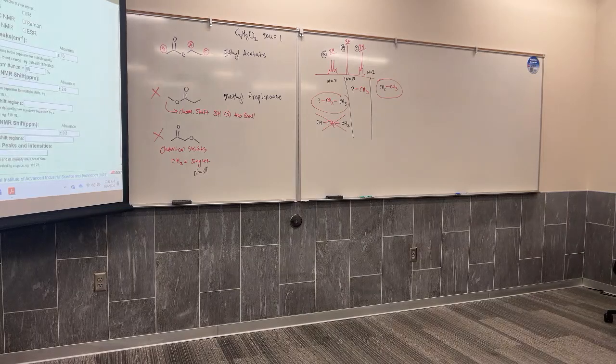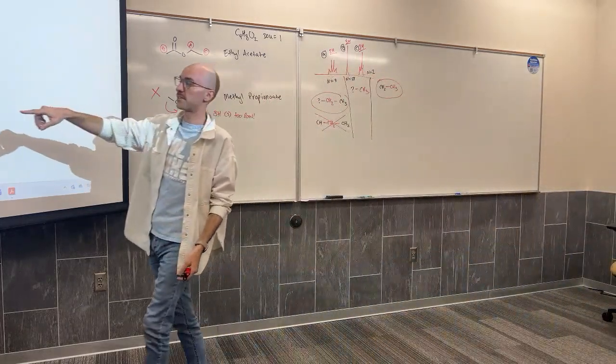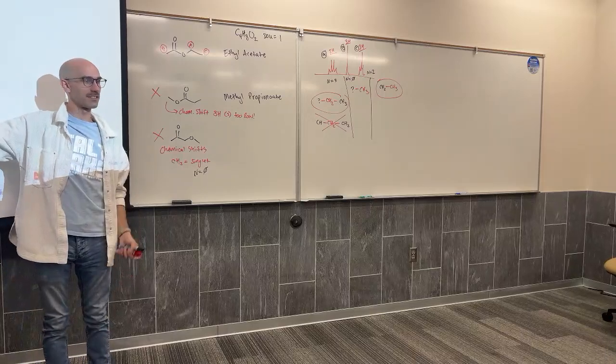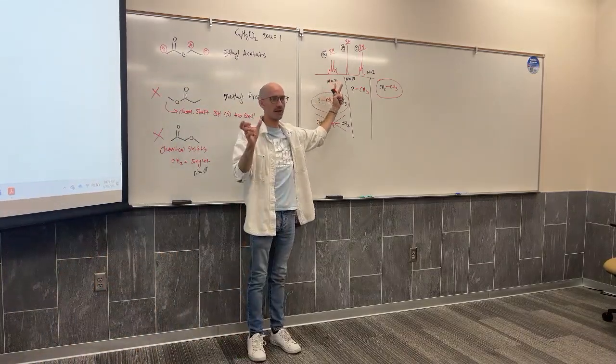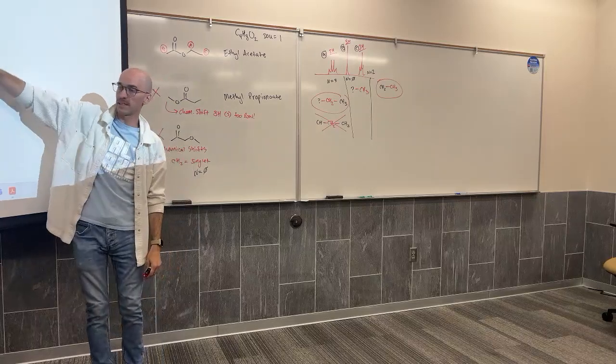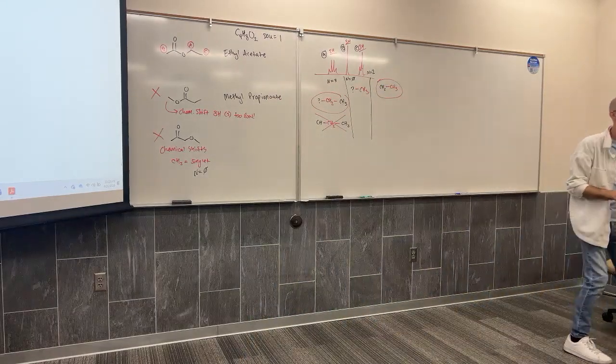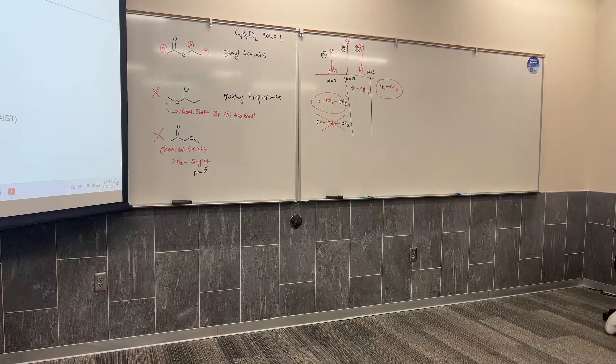Yeah, I should just type in the chemical formula again. This website doesn't always do the best with names. It's got certain names in there and certain names it doesn't. Propionate. So I was very close. Let's look at this NMR spectrum. What do we see? A singlet 3H further to the left. So those two signals that we were talking about, the ones that are both functional group adjacent, they just swapped places. That's all that happened. And the triplet CH3 is still in the same place, because it's still more alkane in both of these molecules. And why don't we take a look again at the IR for this compound?